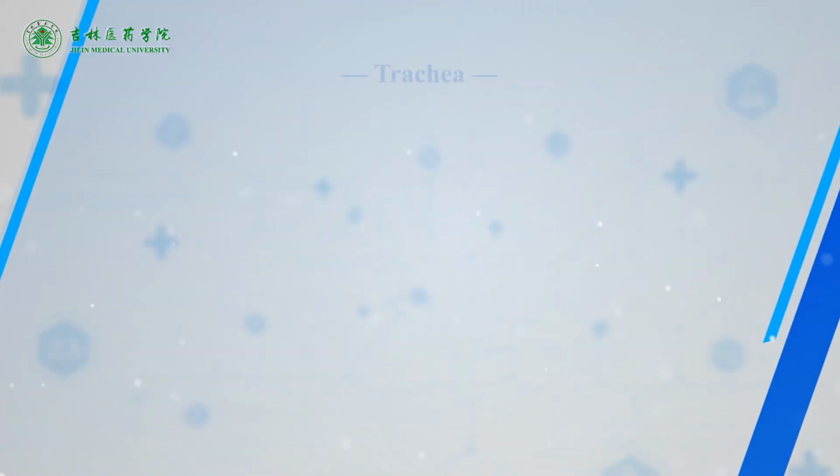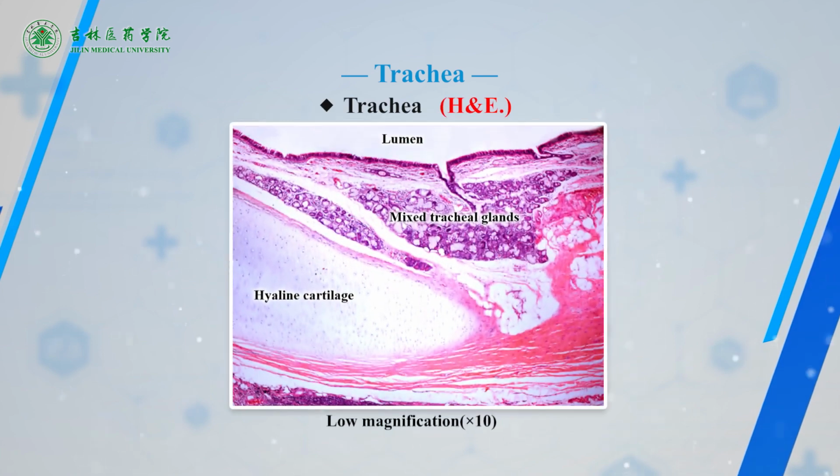First slide: trachea, obtained from the cross-section of trachea, HE staining. The specimen is a luminal structure. The inner surface of the lumen is the mucosa layer, stained purple-blue. Outside the mucosa is the palely stained submucosa containing many mixed glands. The area has small violet blocks.